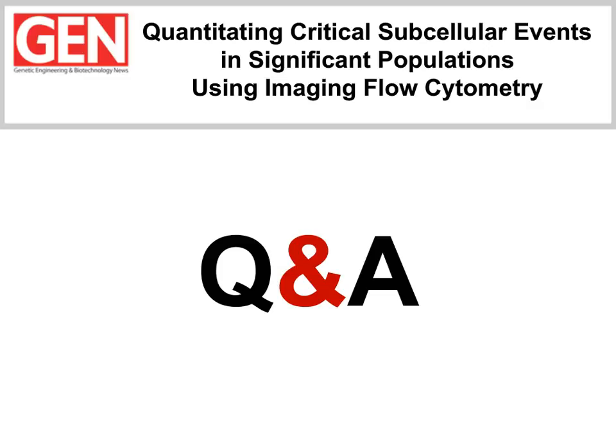And rather than doing a lot of this comparative work now, which is interesting in itself, and this kind of work needs to be done, we're pressing on with the development of some of these diagnostic procedures, because we think it would be really wonderful if we could take a machine like the imaging flow cytometer and actually have it as a diagnostic platform, and that would be very exciting for us.